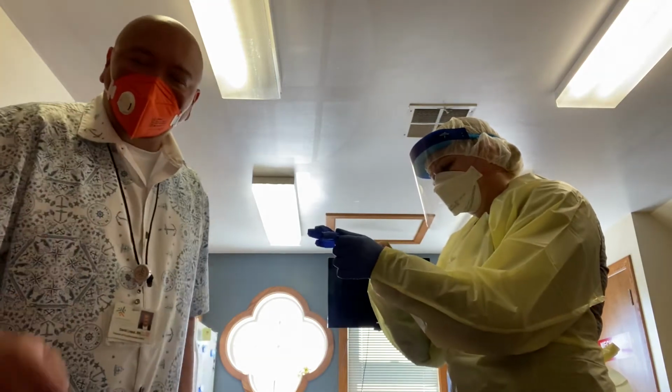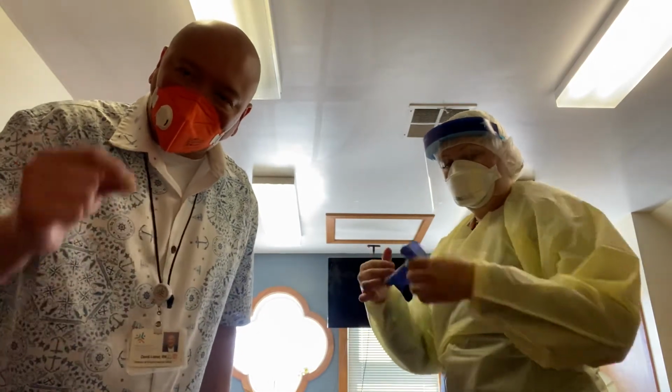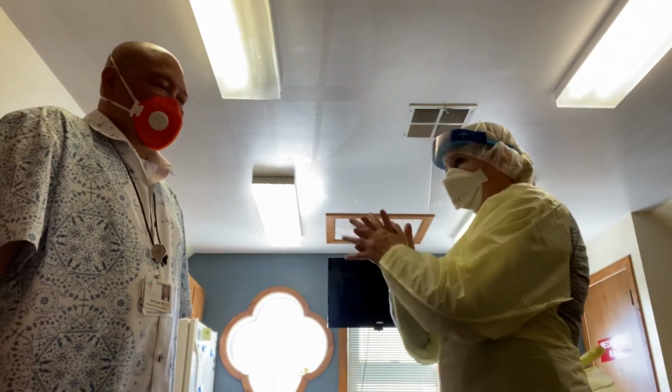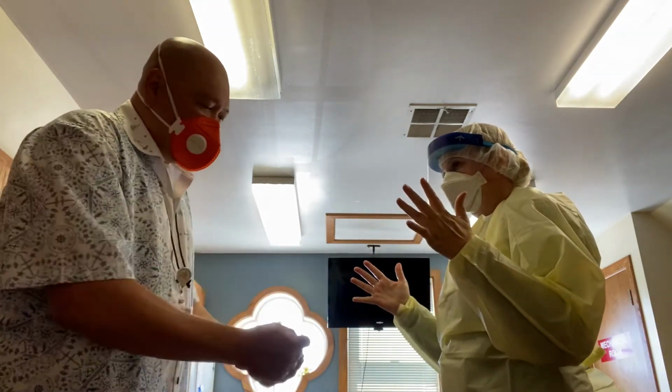Now, at this point, this is critical. You need to make sure that every time you touch something, you hand sanitize. Sanitize again. Then the next step is to remove the gowns.